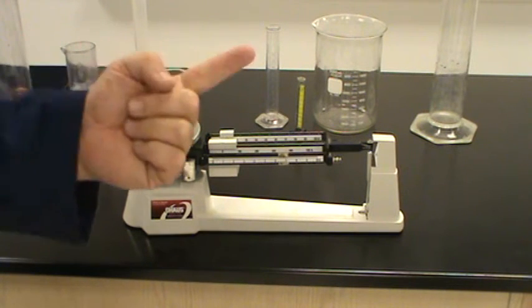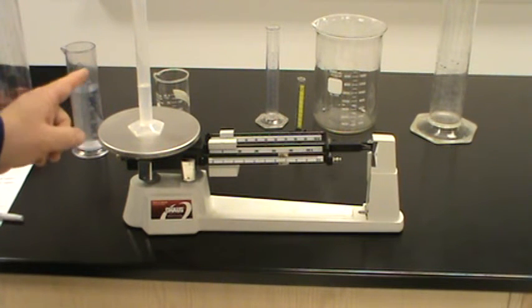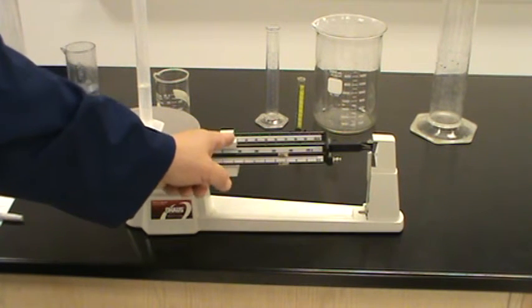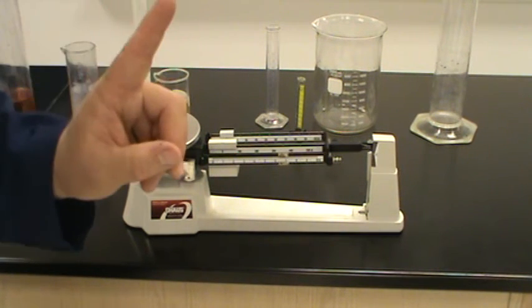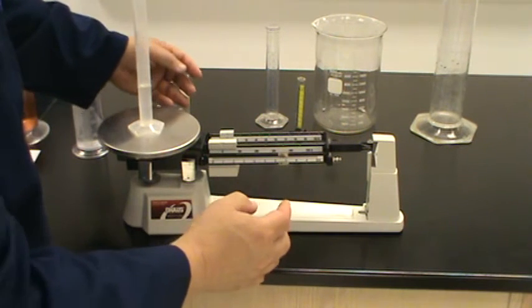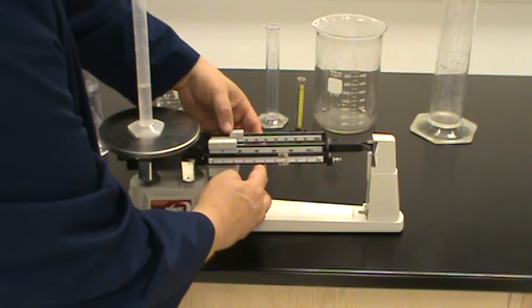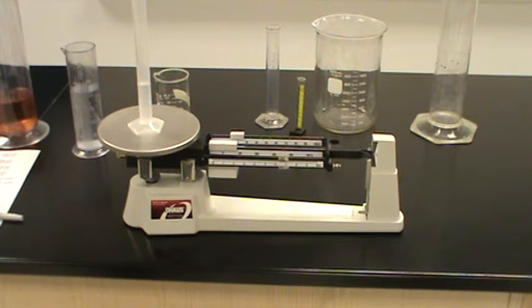If 1 milliliter weighs 1 gram, and we've already accounted for the weight of the cylinder, I should be able to move this 10 grams, and it should theoretically balance if 1 milliliter of water weighs 1 gram. Let's see. Pardon my sniffles too.